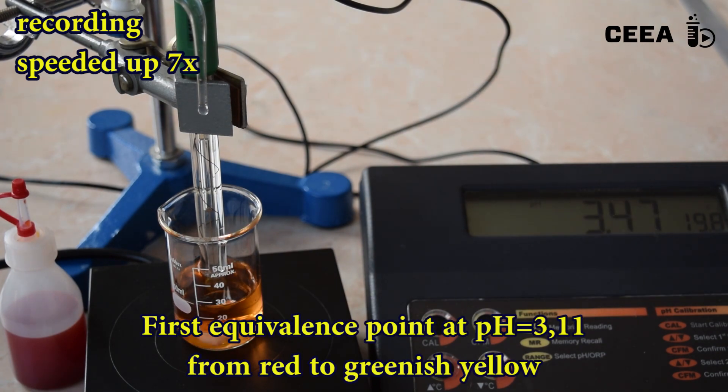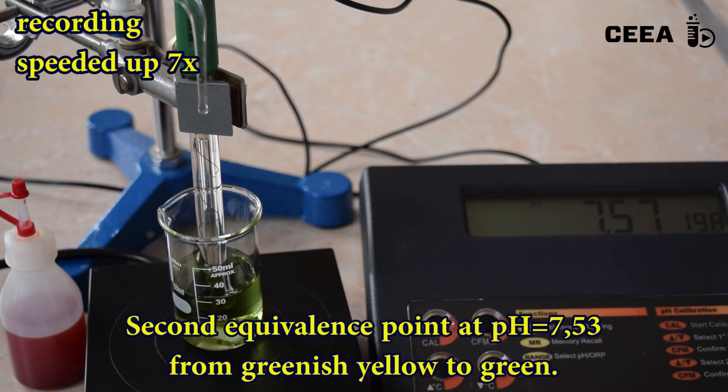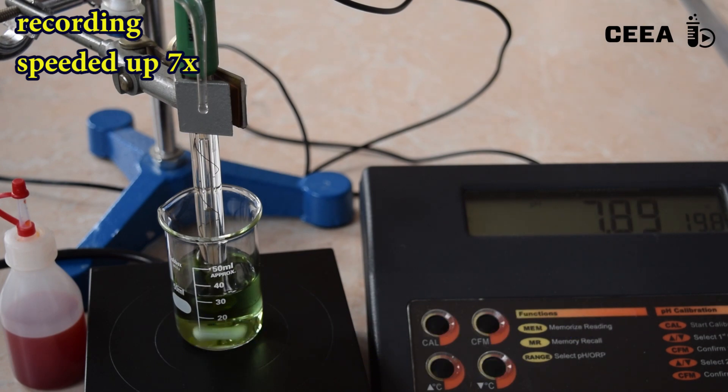First, the indicator turns from red to greenish-yellow. Then, at the second equivalence point, from greenish-yellow it turns to green.